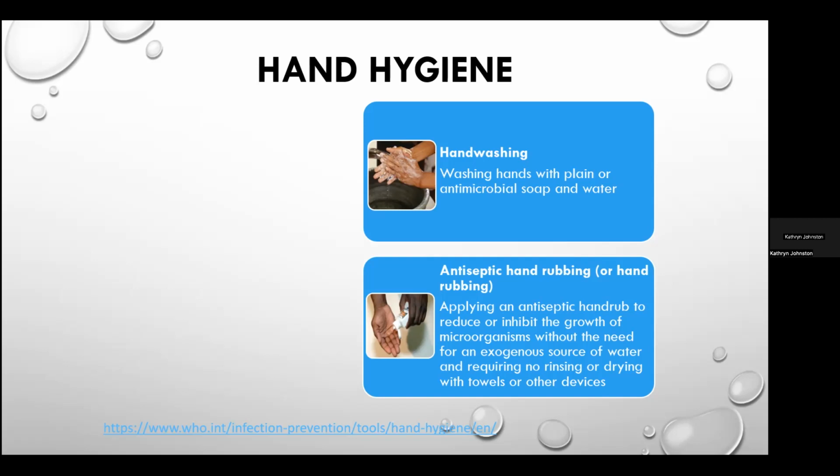The method employed in ensuring that hand hygiene is effective falls into one of two categories, as depicted here. Hand rubbing with an alcohol-based hand rub is the gold standard to perform hand hygiene on all occasions, except for those described for hand washing with soap and water. That is, hand rubbing is the action recommended for healthcare workers for routine day-to-day decontamination of hands.